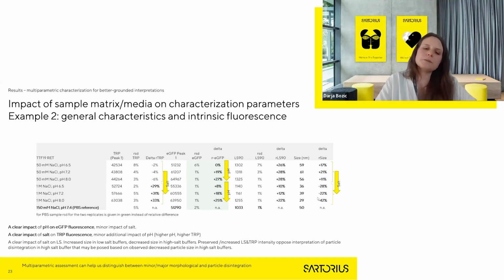For assessing surface markers, I would suggest assessing them one by one before going into immunolabeling, for sure.